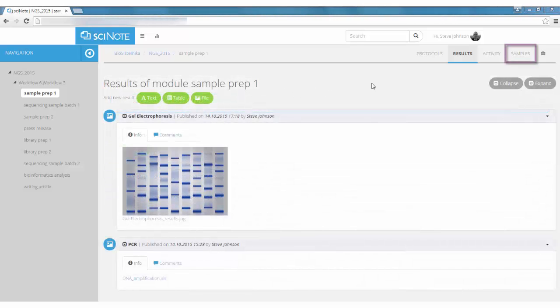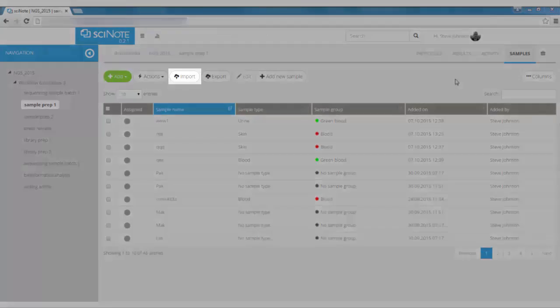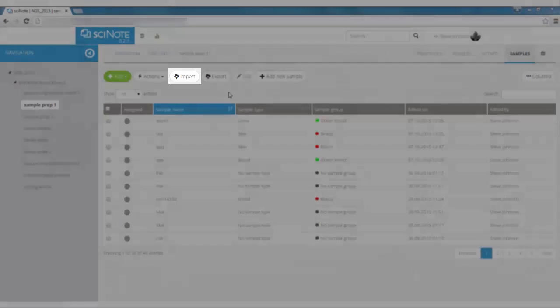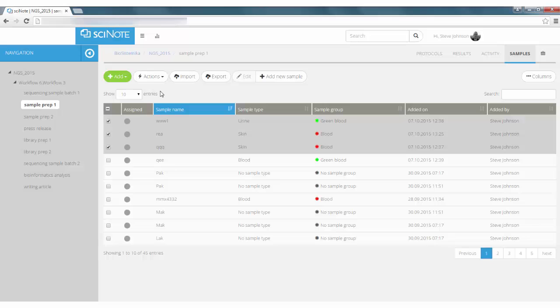You can manage your samples in the Samples tab. Once the samples are imported, it's easy to find them. Select and assign them to a specific module to assure traceability.